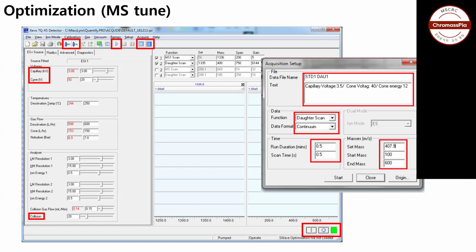Can you people speak in the mic so we can also listen? When you did it manually and with IntelliStart, the values are different, right? When it's done automatically and then you compare with manual optimization, they are different. There's no match. Okay, thank you.